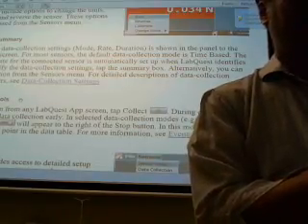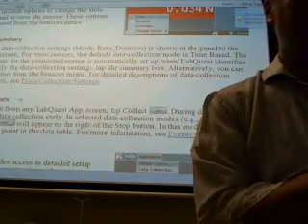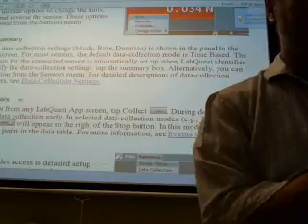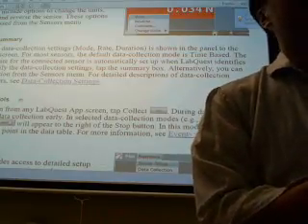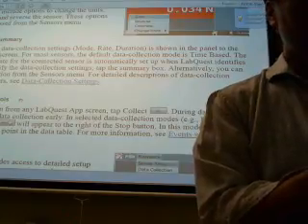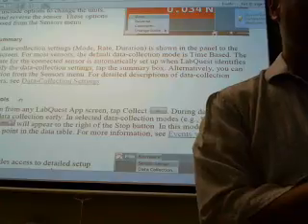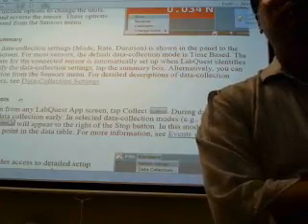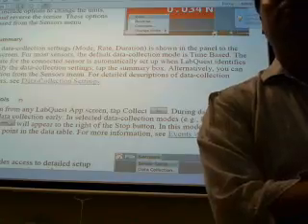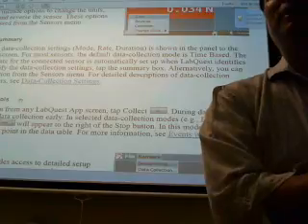One sixty? Yeah, that's hard. The rate is going to be not even one sample per second, which is unusual. The rate is going to be 1/60th. So what is 1/60th? When you tap on that, we're going to enter it in there. One divided by 60 is 0.0166, repeating sixes.